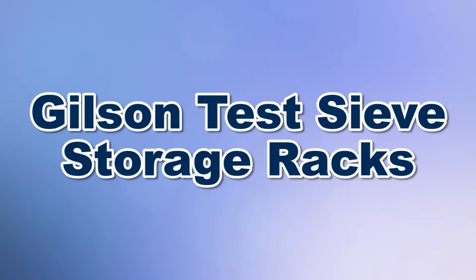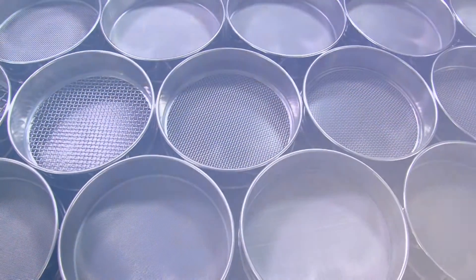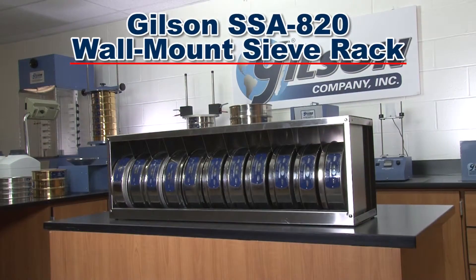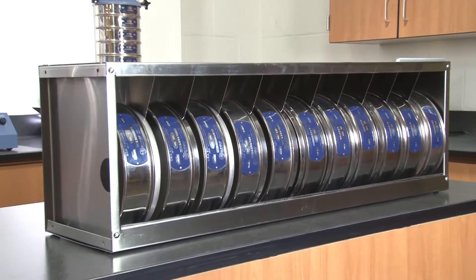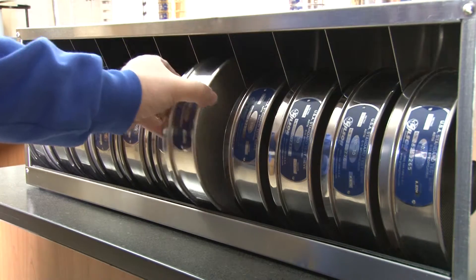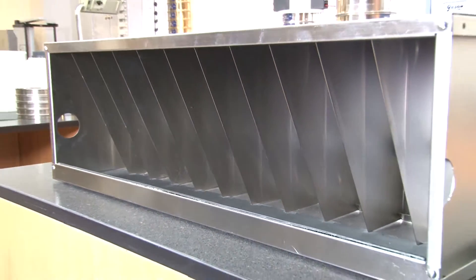Proper storage of your test sieves helps keep them safe from unnecessary damage. The Gilson SSA 820 Wall-Mount Sieve Rack is designed for 8-inch diameter test sieves. Sieves are held in place within 11 individual compartments, each holding one full-height or two half-height 8-inch test sieves. Compartment bottoms are neoprene lined and inclined to keep sieves secured.